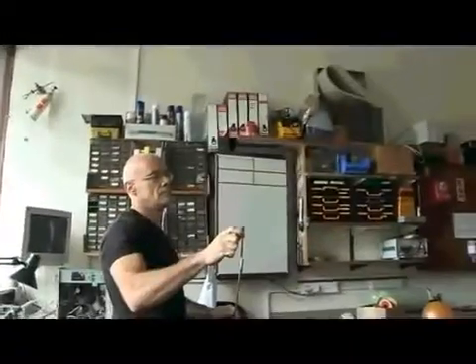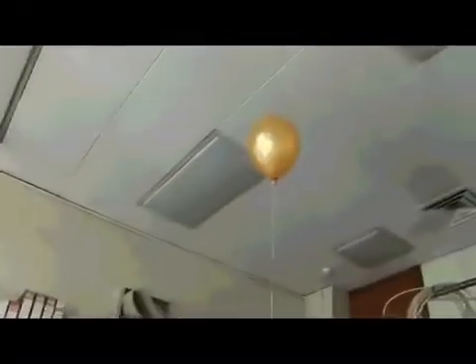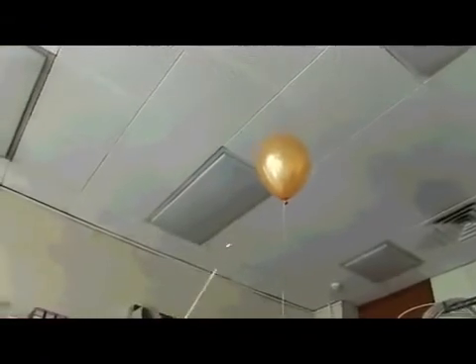Match on a stick to hydrogen. Big bang coming. You ready? Yep, here we go.